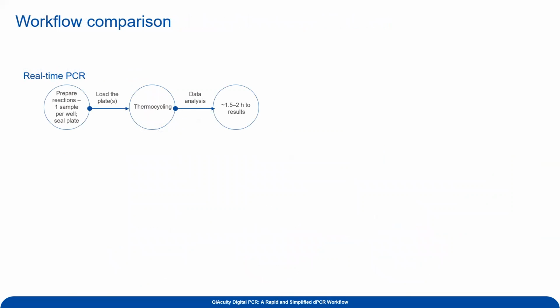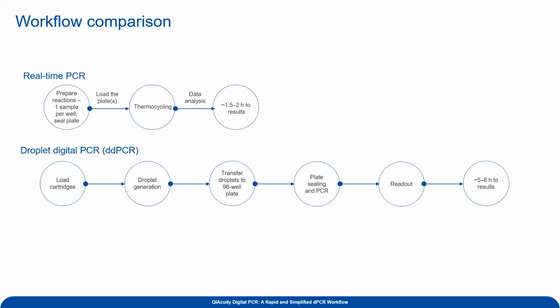And just in terms of the relative workflow, if we think about real-time qPCR, you're looking at about 1.5 hours to 2 hours for standard cycling conditions for your time to results.